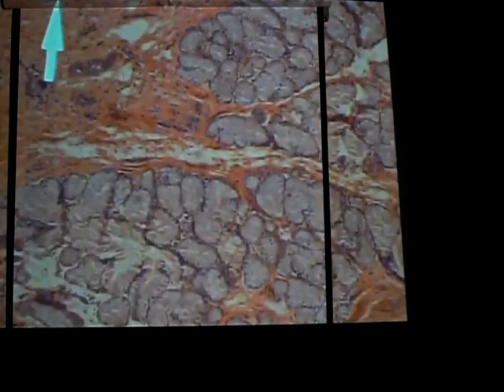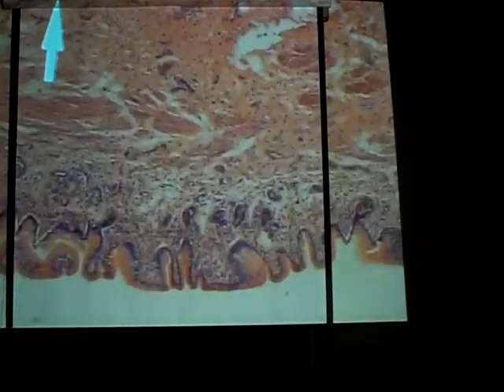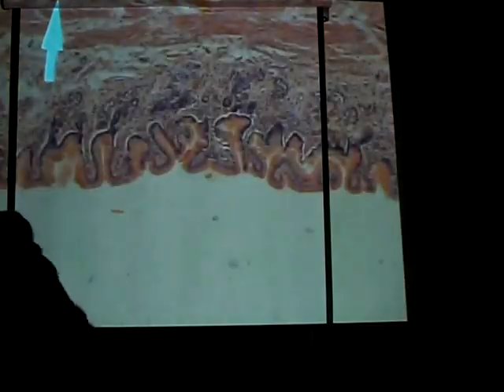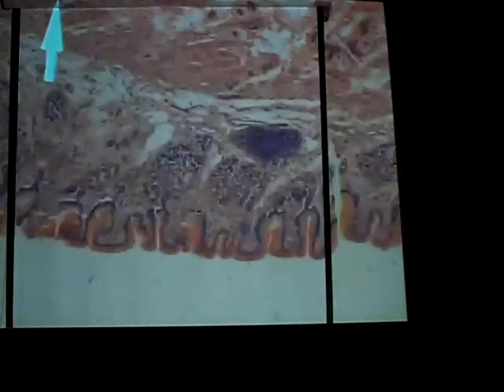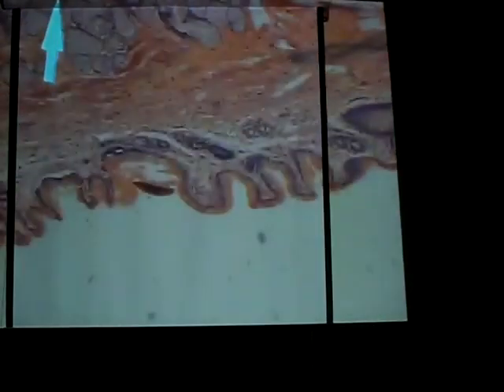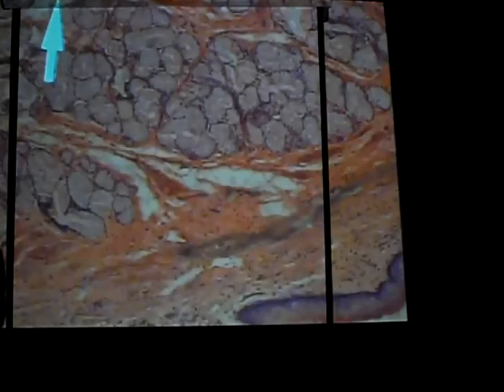Alright, so this region of the stomach is pretty much the first part. So this would be our cardiac stomach. We have the cardiac stomach, and most of the stomach is called the body of the stomach, the fundus or the fundic stomach. That would be like the middle region, and then the end that's closer to your duodenum is your pyloric stomach. Once you see that transition from the stratified squamous epithelium into that simple columnar epithelium, then you know that that's your cardiac stomach.